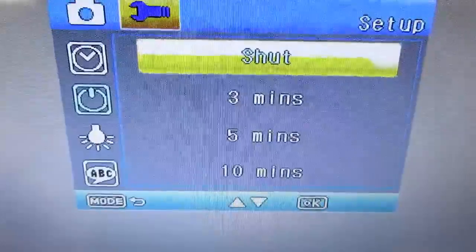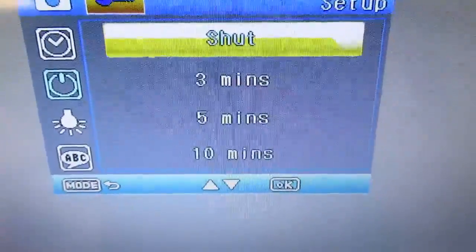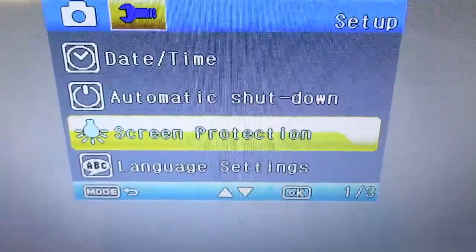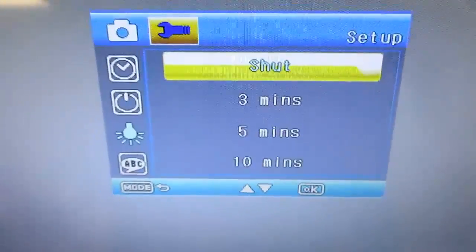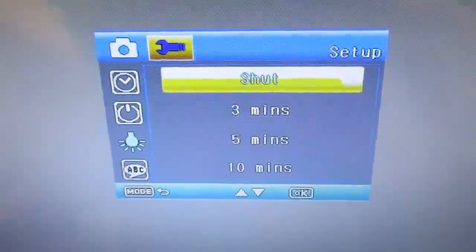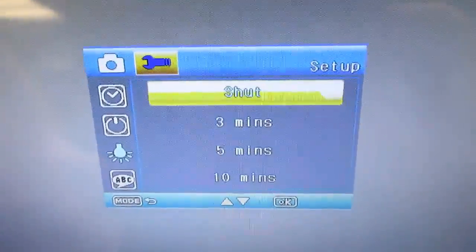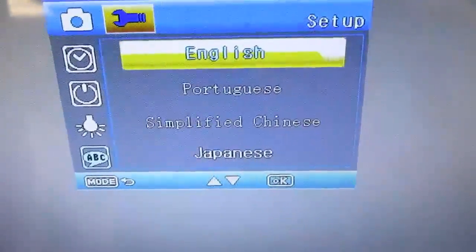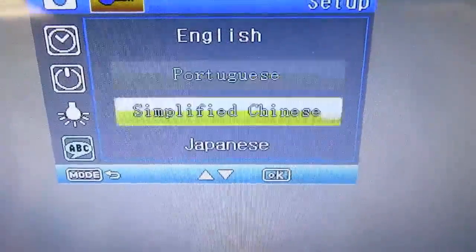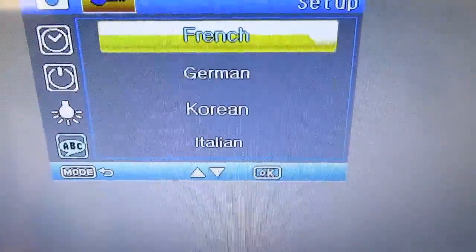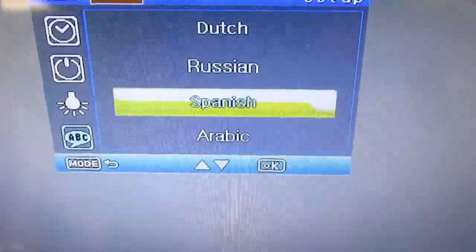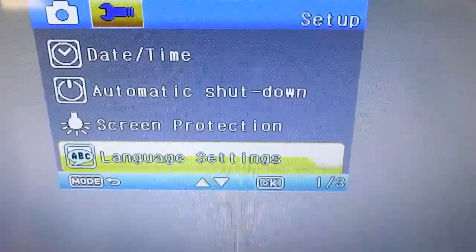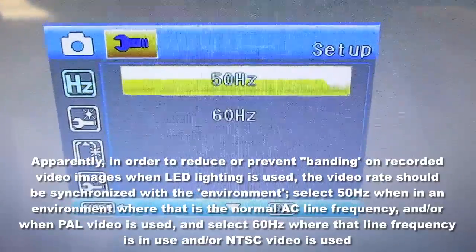So, automatic shutdown. It's currently set to no automatic shutdown. That's good. And then screen protection, which I'm pretty sure has to do with just shutting down the screen without shutting down the whole thing. But if you do that then it looks like it's going to be broken, right? You won't know that it just did a screen shutdown. I think that would be confusing, so I'm going to not change that. Language settings. You can go to English, Portuguese, simplified Chinese, Japanese, French, German, Korean, Italian, Dutch, Russian, Spanish, Arabic, back to English. So I click OK.